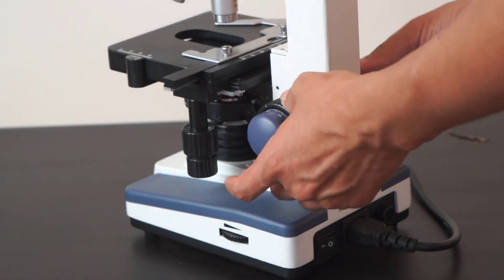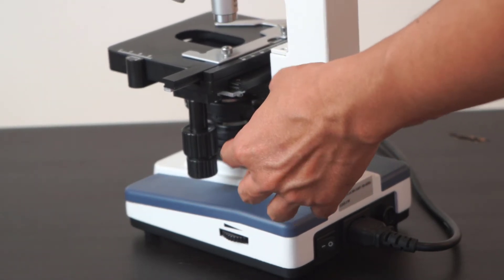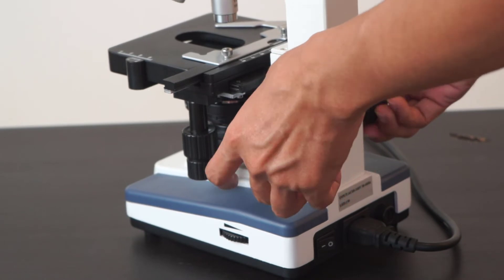To focus the scope, use the coarse knob. For fine focusing adjustment, you can use the fine focusing knob.